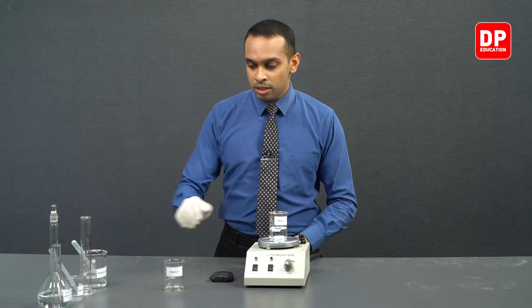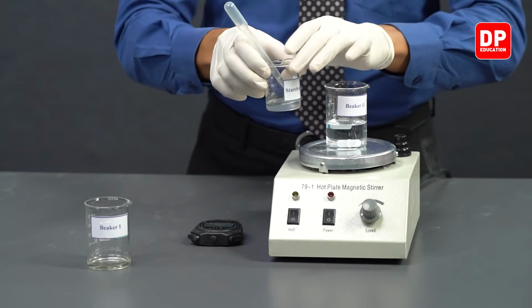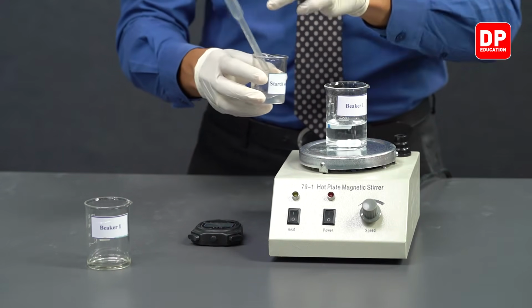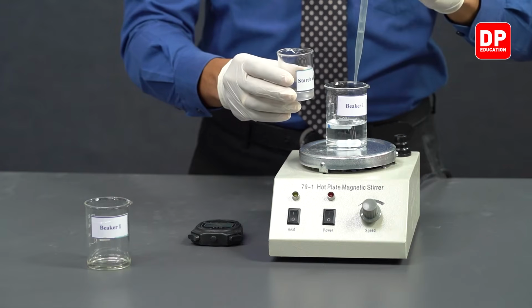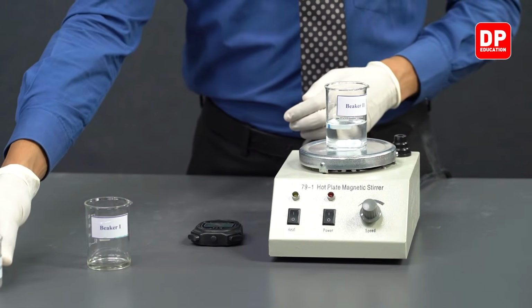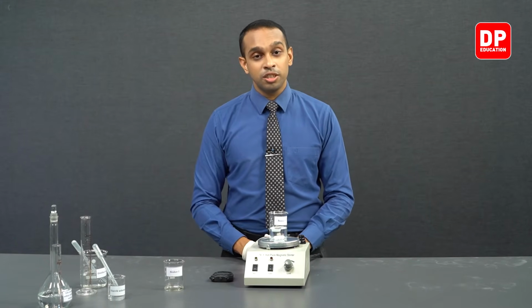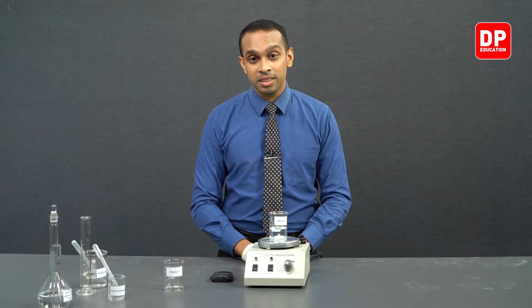So we need to add starch solution as well. So let's add starch solution. And now it is time for us to add the contents in beaker 1 to beaker 2.